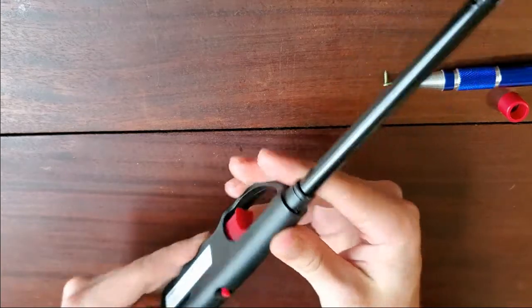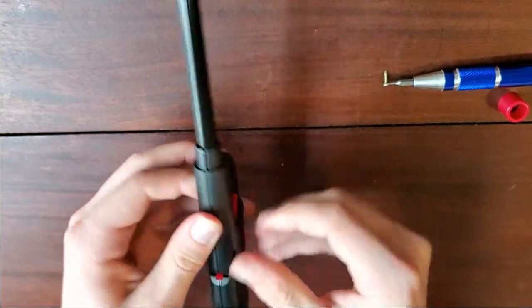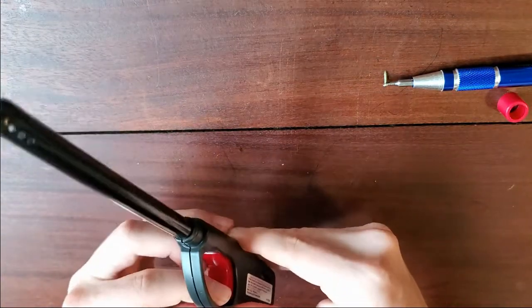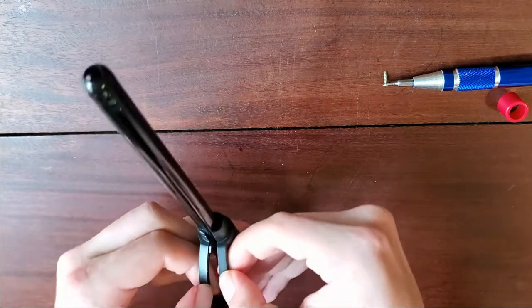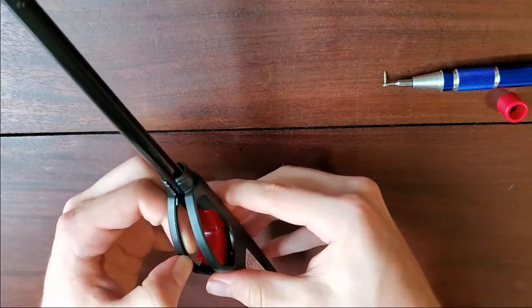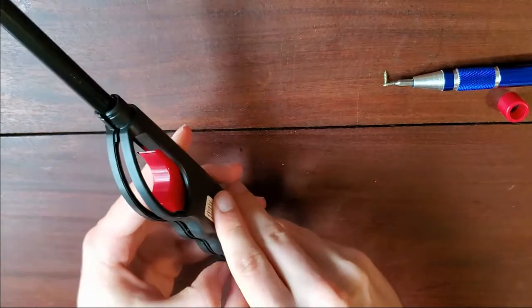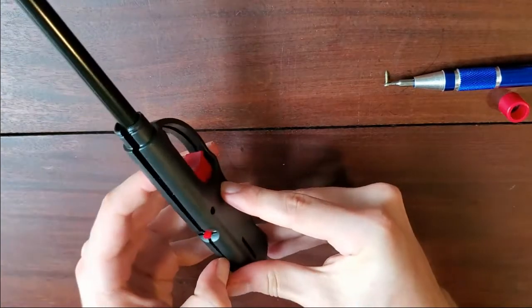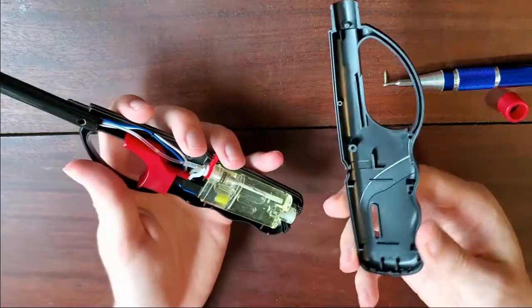From there, you can start to kind of pry the casing a little bit. Slowly work it, and once you get it, it just kind of goes — almost there — there we go, and there it is.